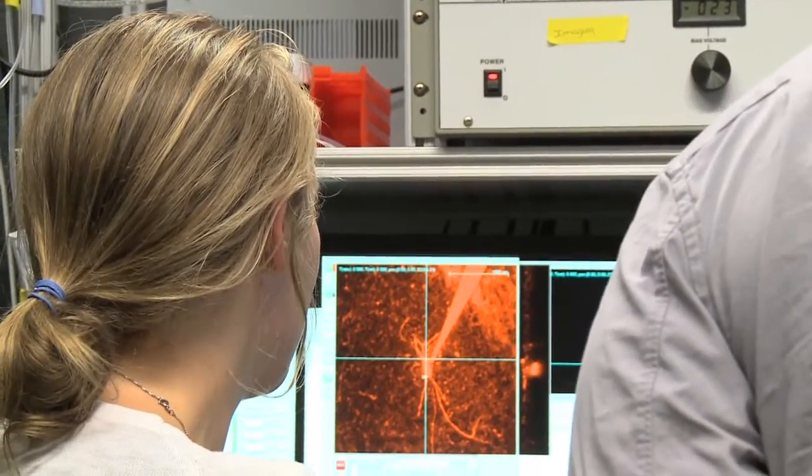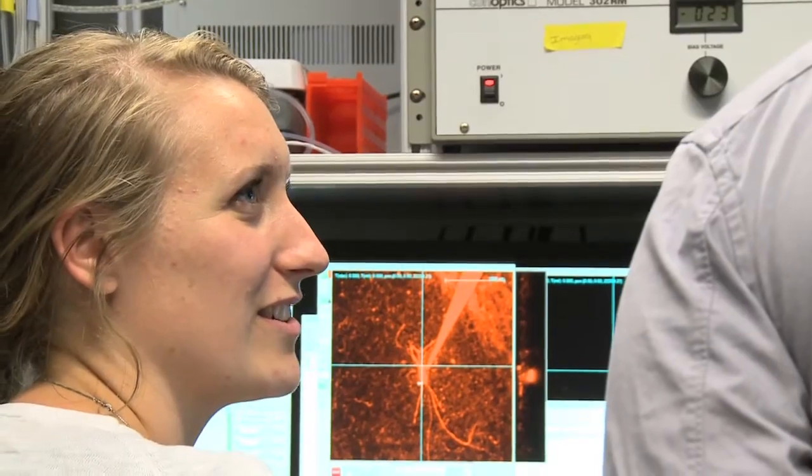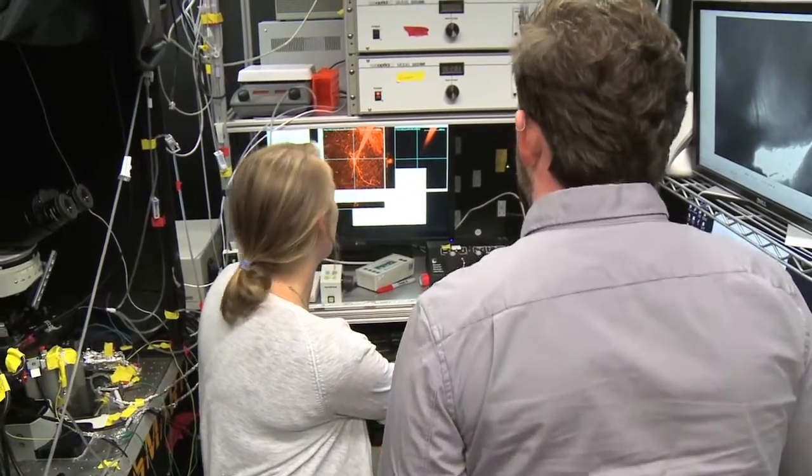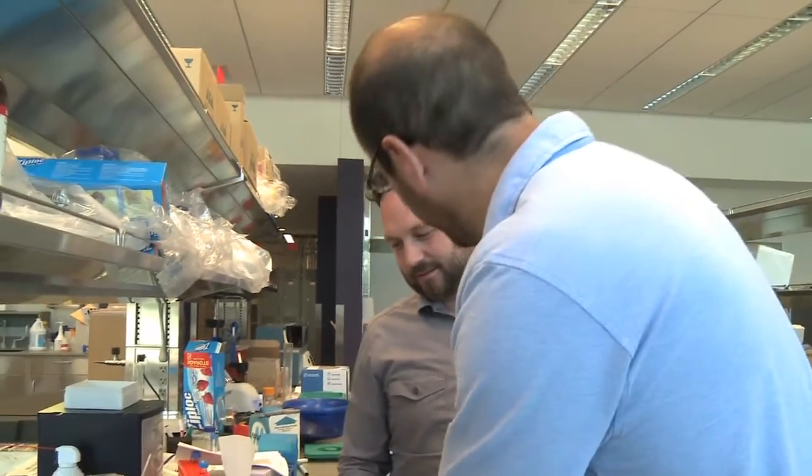I think that's because the activation doesn't last that long, and they're not very good unless you do activation. Where is that neuron? I think this is an SNI neuron. So there are tons of fibers in there. We can hold off for a few more days just so we can put the last one in here. Put it on dry eyes.